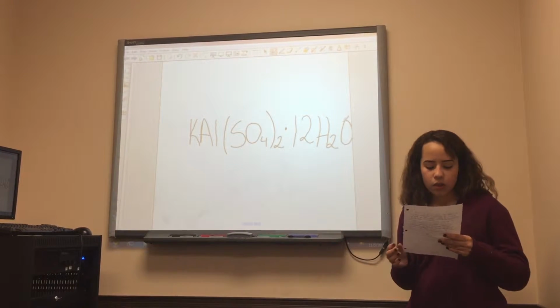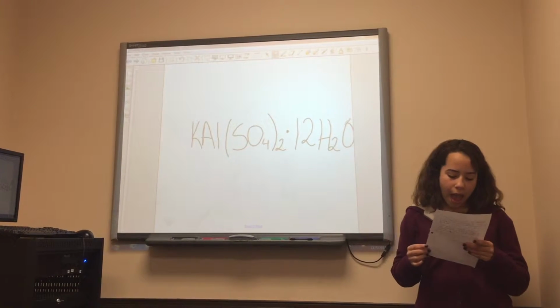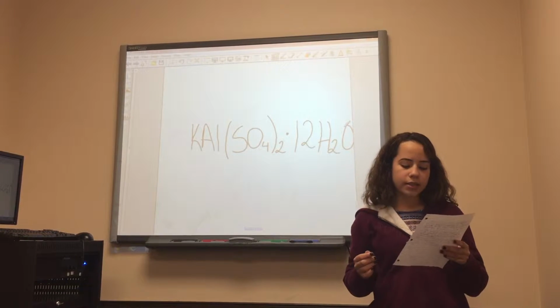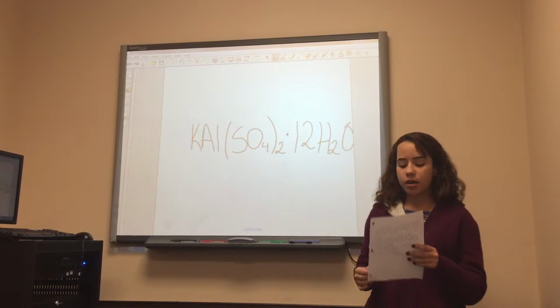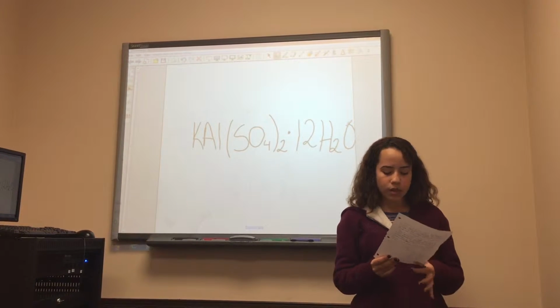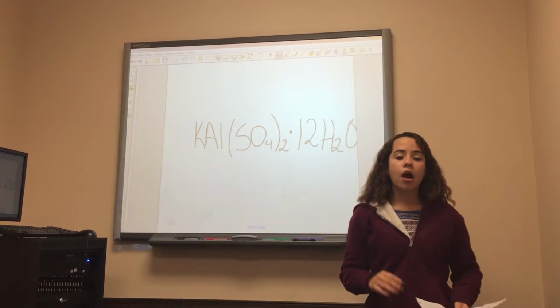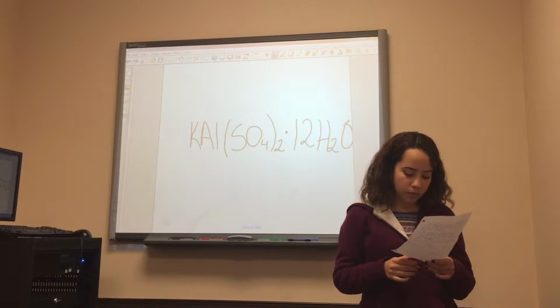Also, we are going to use it with 12 molecules of water, also known as dodecahydrate. Then we will synthesize this compound by using aluminum ions in an aqueous solution. All this process is going to be exciting because we are going to witness physical reactions as well as chemical reactions.